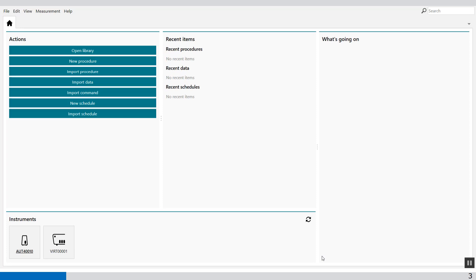We can do this completely automated with the following commands: the windower command to select the last 10 points of each overpotential; the calculate signal command to calculate the mean values of the current, potential and power values provided by the windower; the build signal command to filter all the average values of current, potential and power of each overpotential; and custom plots to make a specific IV and power versus current graph.